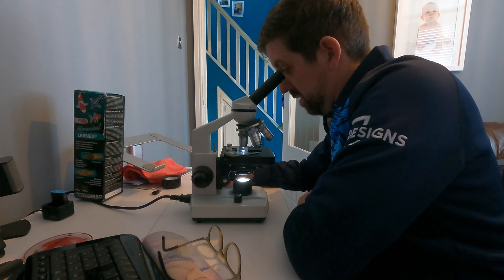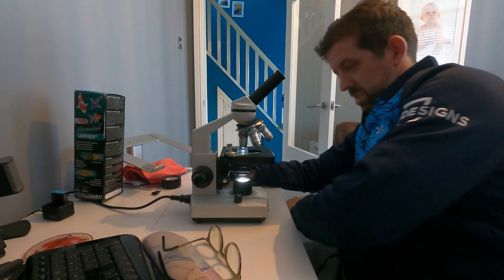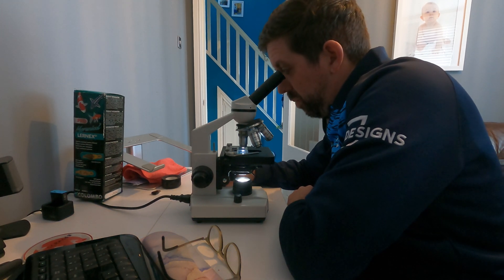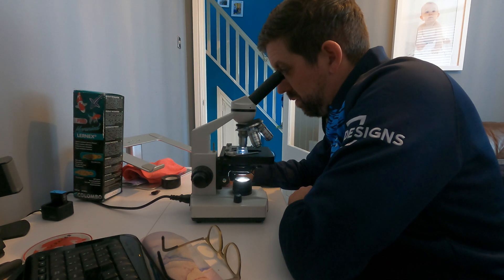I'm just having a look now to see if I can see anything. Being able to move the slide without taking your hands off — like I had to do on the other microscope — makes life a lot, lot easier.